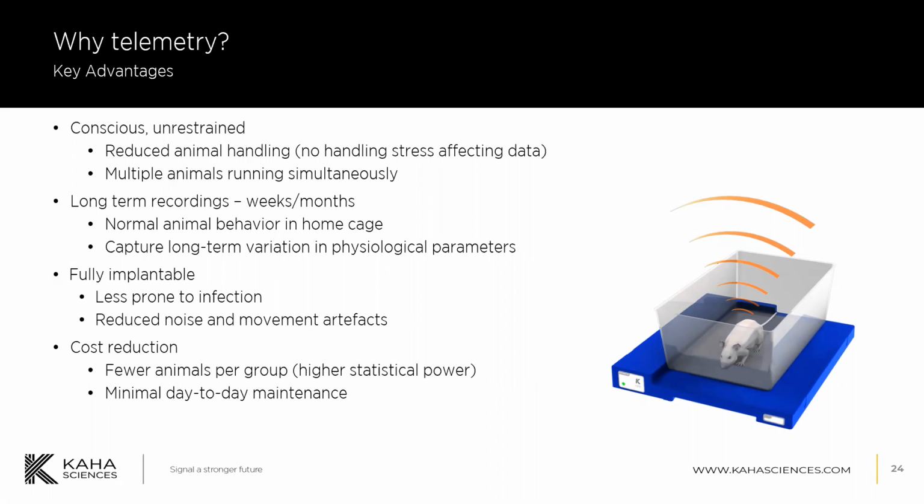Now, there is, of course, an initial investment in the telemetry system, but most users agree that this pays off very quickly because you're able to use fewer animals per group, and by doing a within-animal comparison of before and after, or before and during your treatment, for example, with the development of a disease, you get a much higher statistical power, and that improves your results and the scientific questions that you can look at. And there's actually minimal day-to-day maintenance of the telemetry system. As long as you're looking after the animals and their welfare, the telemetry system will continue to record your data pretty much independently.